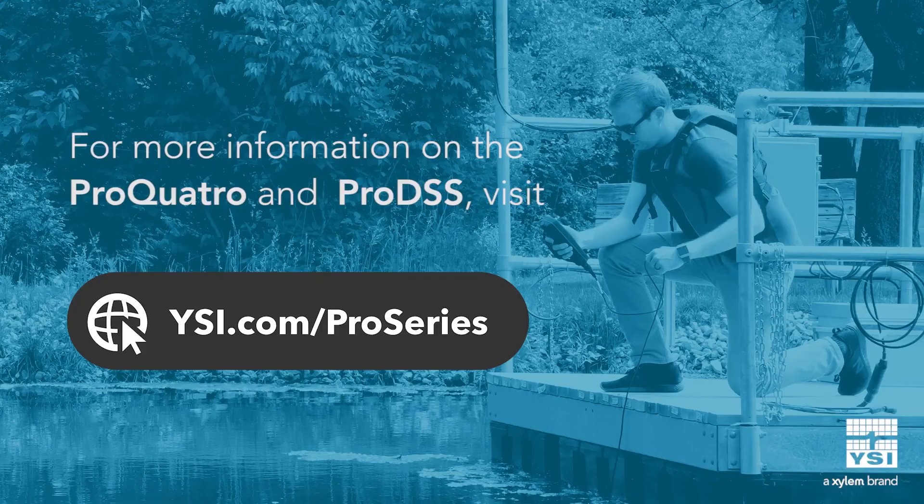While both instruments are powerful, the Pro DSS offers superior functionality and additional measurement capabilities that distinguish it as the ultimate sampling handheld. No matter which instrument you choose, the YSI Professional Series sets the standard for water quality sampling. You can learn more about these instruments and our full range of options at ysi.com/pro-series.